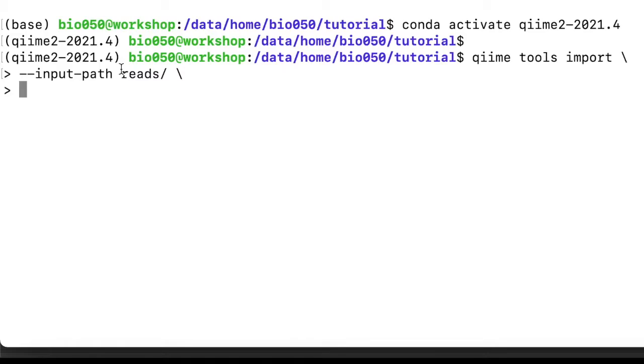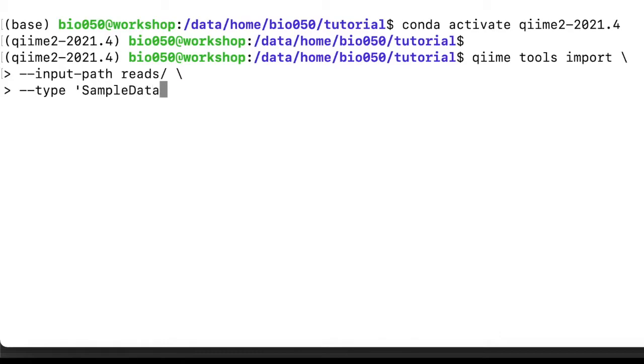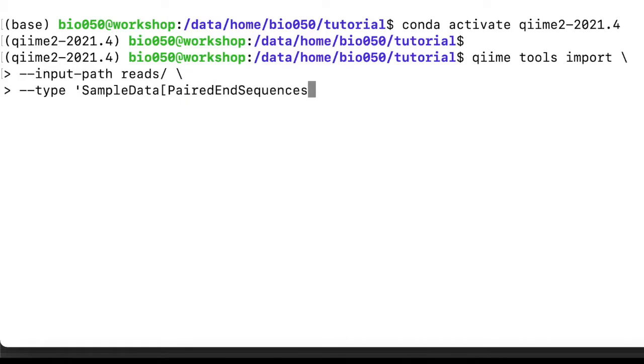We need to specify what kind of artifact we are going to import, because import is a generic command and can be used to generate various artifacts. I could import a tree, for example. In this case we are importing, what the type is, and let's use single quotes to specify this, so SampleData and then in brackets paired-end sequences with quality.